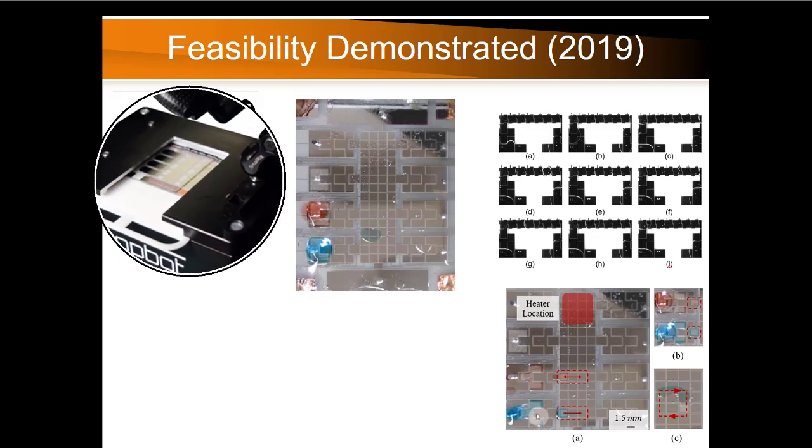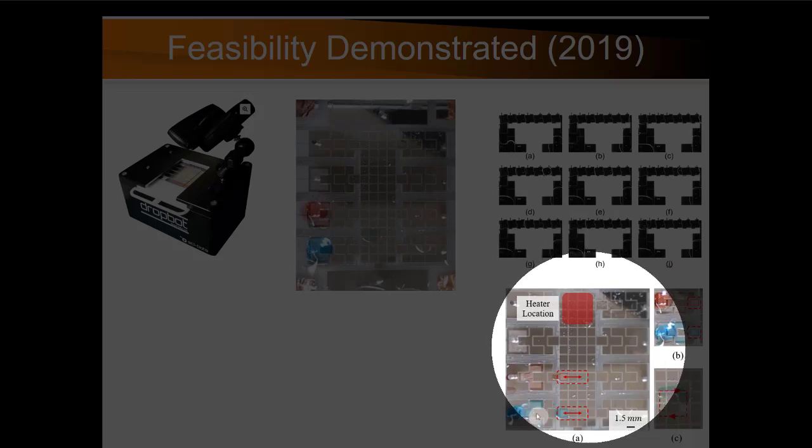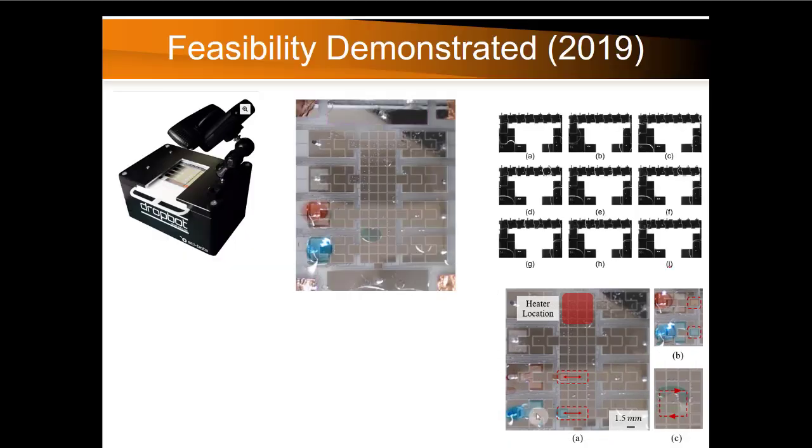So we had to modify our production of things in the clean room to be able to seal this device up, fill it all with oil, like a silicone oil, and then we're loading droplets and moving them around. The reason for doing that is we reduce biofouling so that we don't get deposits of this biological material on the surfaces. And then if you have a process that takes a little longer, you also don't get evaporation.